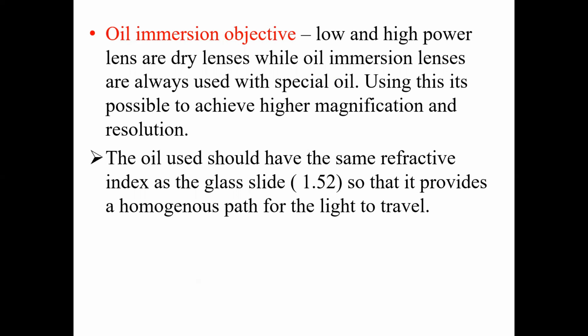So what is the kind of oil? We cannot use any oil for an oil immersion objective. It is very important that the oil used for the microscopy should have the same refractive index as that of the glass slide, that is 1.52, so that it provides a homogeneous path for the light to travel. So this is very important. The refractive index of the oil used and that of the glass slide should be the same.